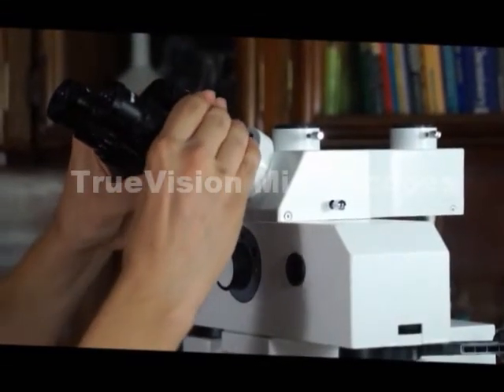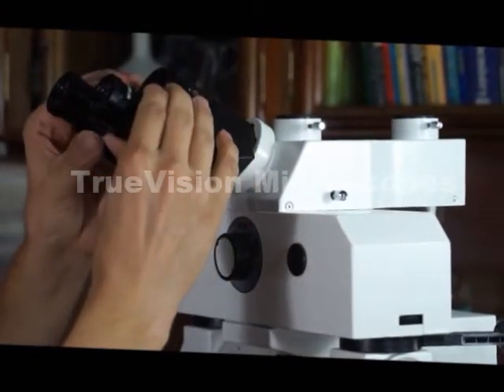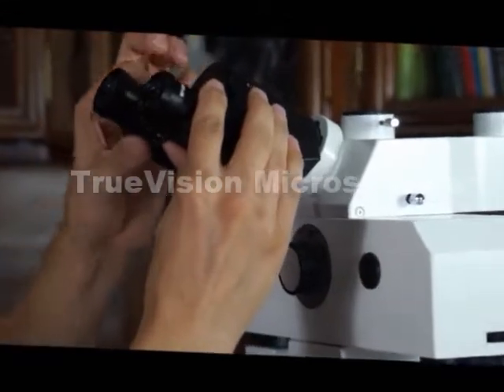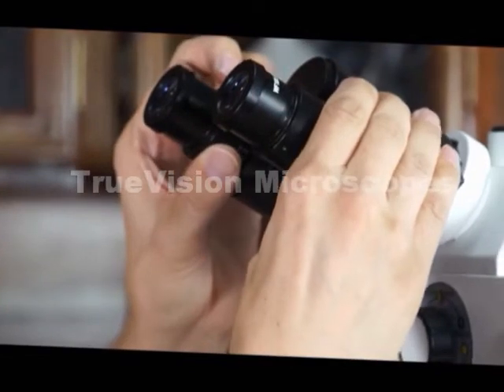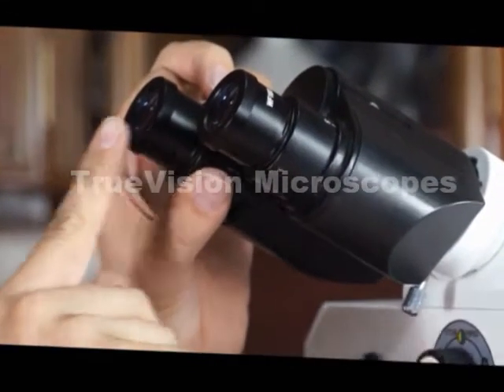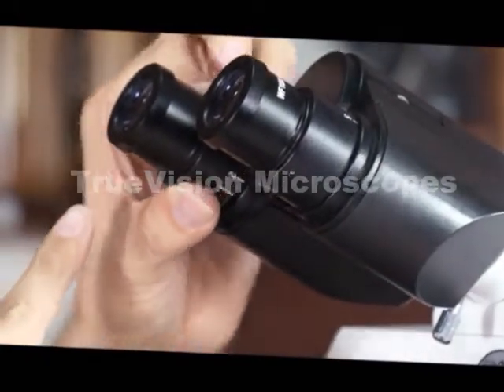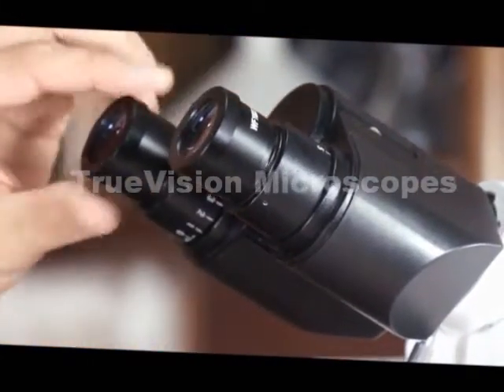This particular head has the typical interpupillary distance adjustment. It also has a diopter adjustment. The diopter adjustment is so that when you get one eye into focus, if the other eye is not in focus, you can adjust it so that both eyes are in focus at the same time.